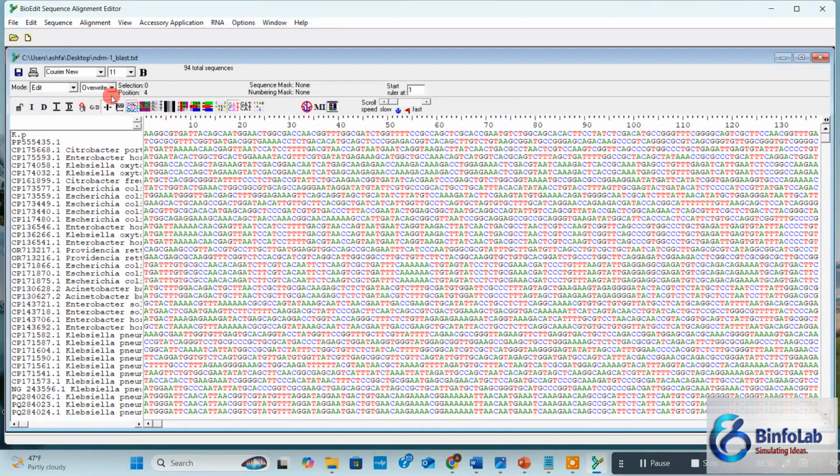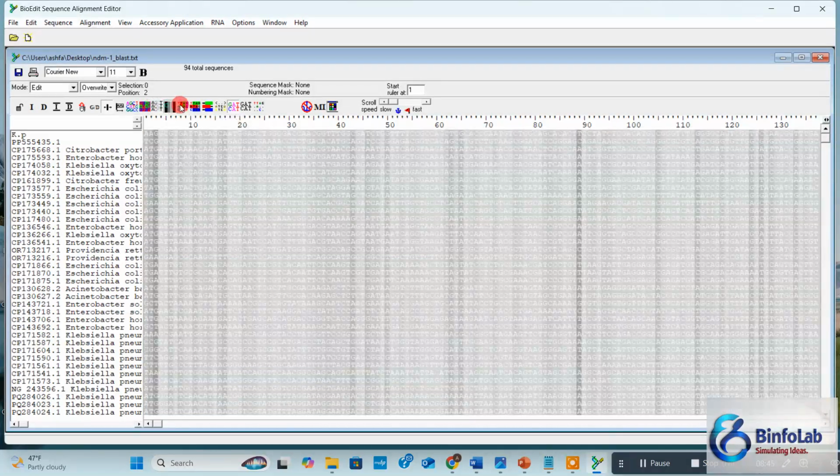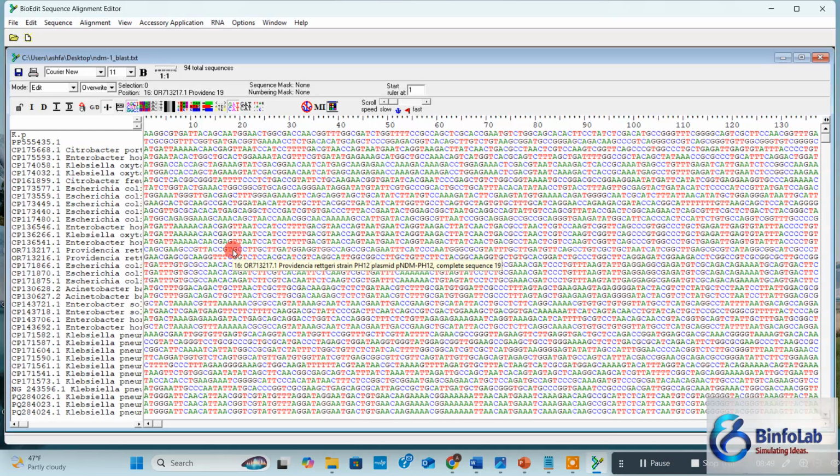If you see these color bars, it changes the color. Let's say if you click here, you can see these are the different options. If you want to explore, you can. There are some other coloring schemes. Next, the next important thing is to explore these things.